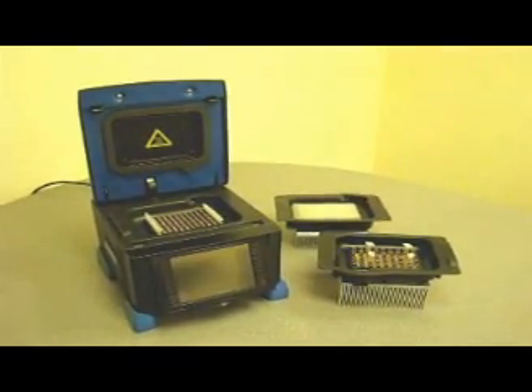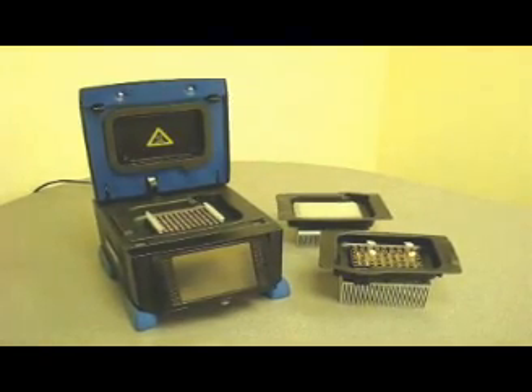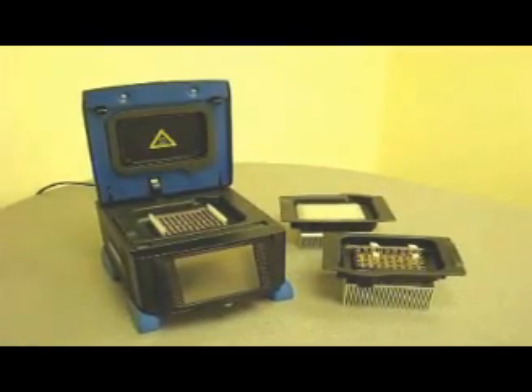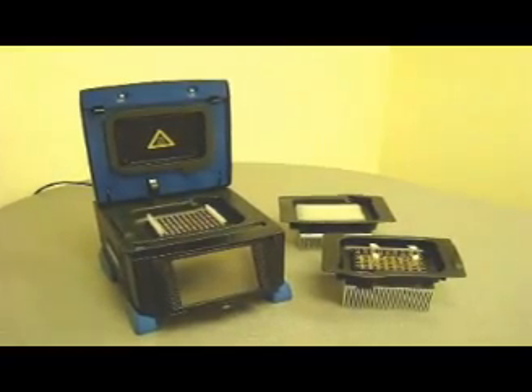For all the specific specifications, please review the Amplitronics section at our website. Amplitronics cyclers are setting the new standard in thermal cycling today.